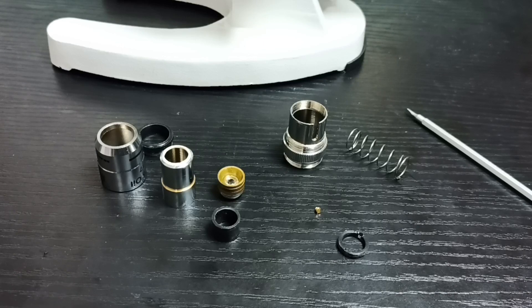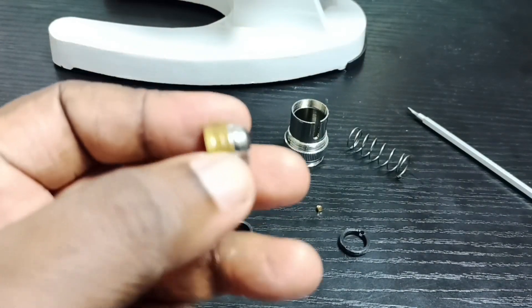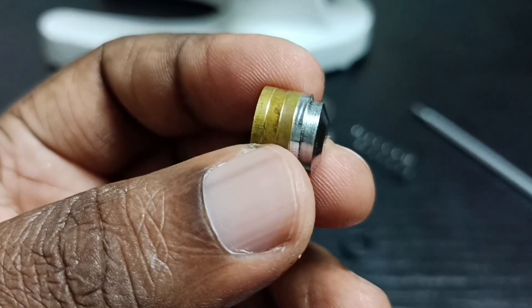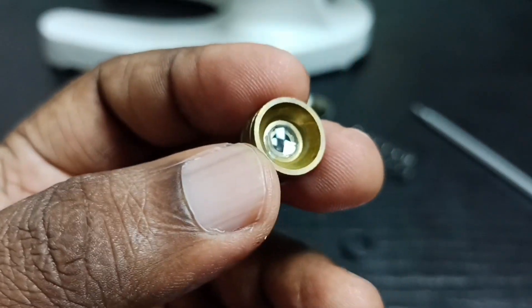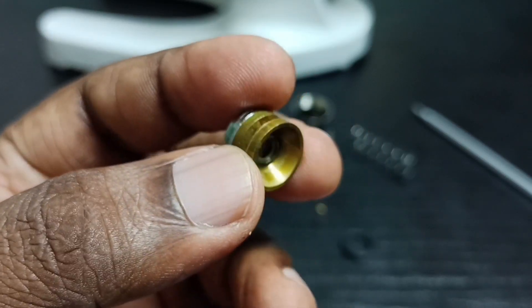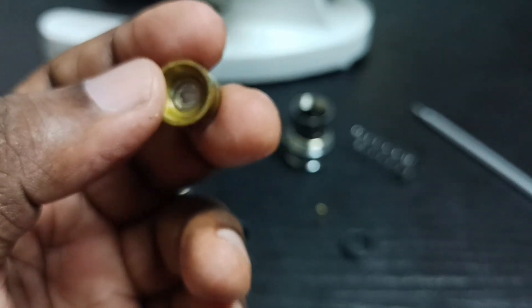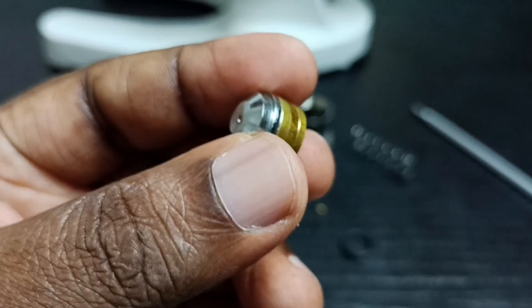I have taken that lens outside — so this is the lens. We can clean inside. This way we can open the objective lens of the microscope and clean it.